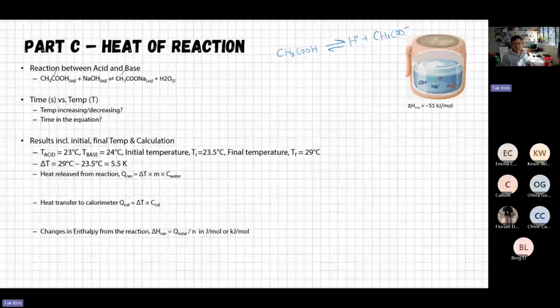In terms of acid strength or pK value, if you remember the meaning of pK value. Anyway, regardless, if you don't see differences, that is all good, but that is what you expect to see. And sometimes things don't go well. So because of that, you might have a higher temperature difference than part B, which is also fine. As long as you understand what we are looking at, I'm more than happy. So it's the same process.